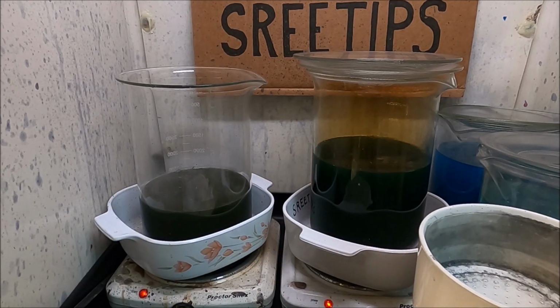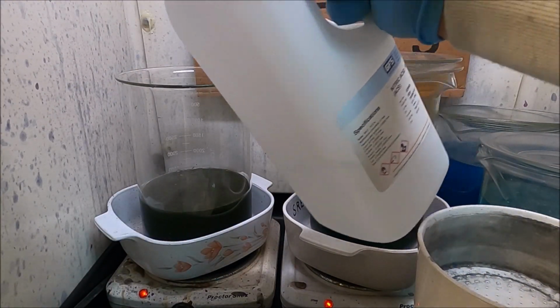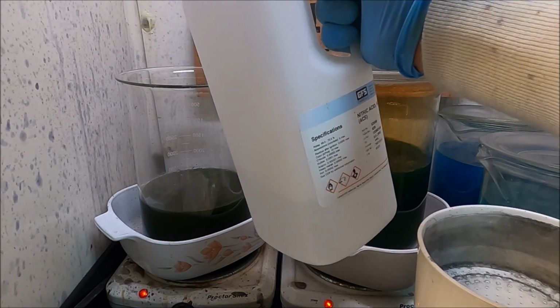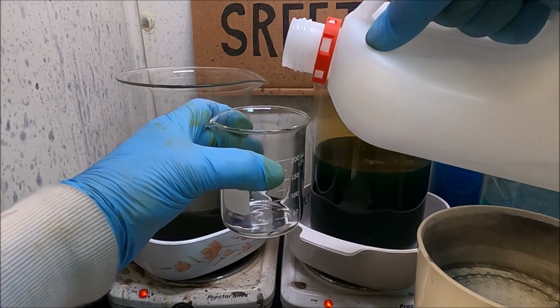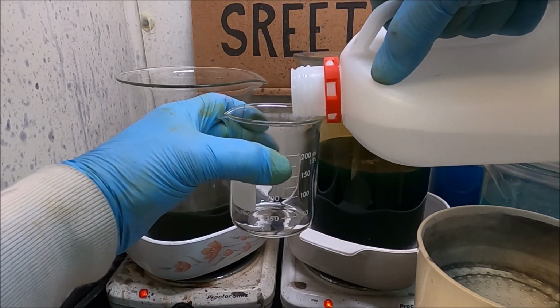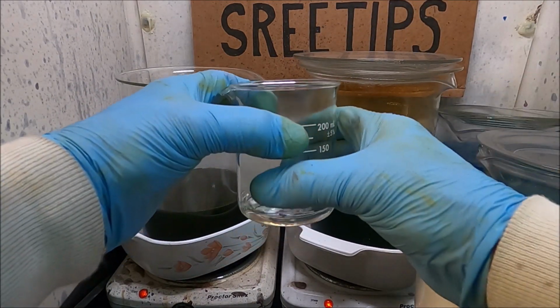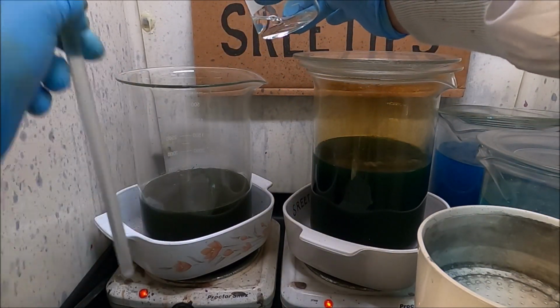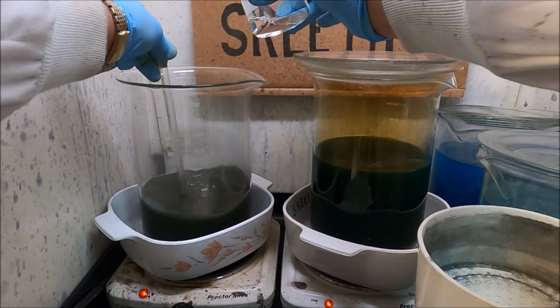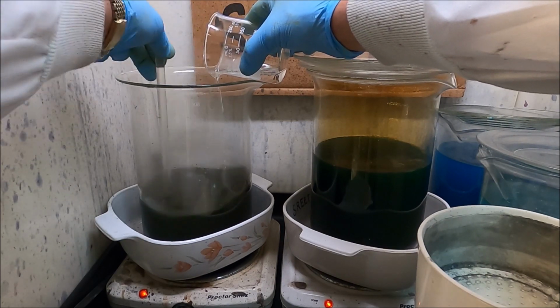Now what I'm going to do is I'm going to add a dose of straight nitric acid to this beaker to help me judge where we're at as far as dissolving the soluble material in that beaker. It's not very much here, maybe about 20, 25 ml, 20 ml or so. Just going to add this in and with some stirring. And see where we're at, see how badly this flares up when I add this straight nitric in.